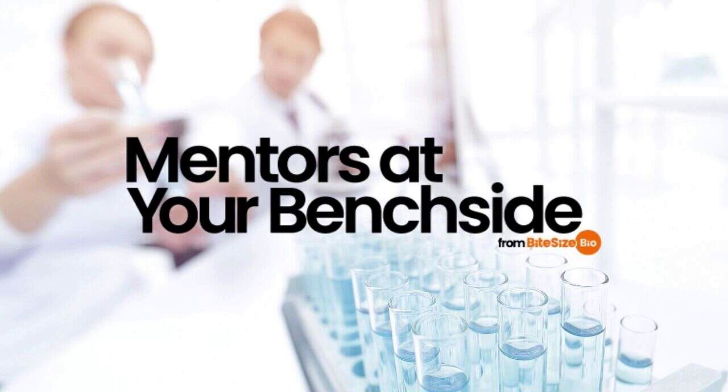If you are using a whole cell or tissue lysate, the problem lies with the separation itself. Make sure the pH of the running buffer and Tris solutions used to make the gel are accurate. And don't forget to check the electrophoresis settings to ensure the voltage is high enough to move the proteins through the gel.